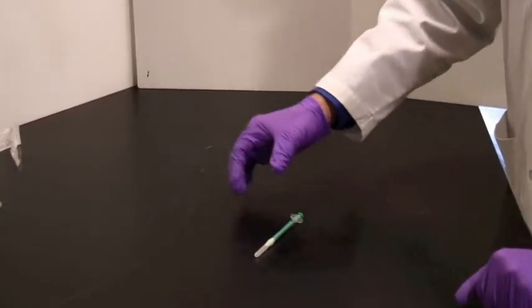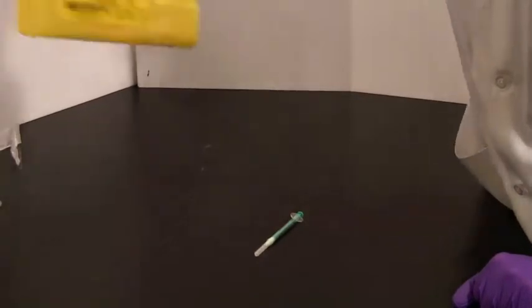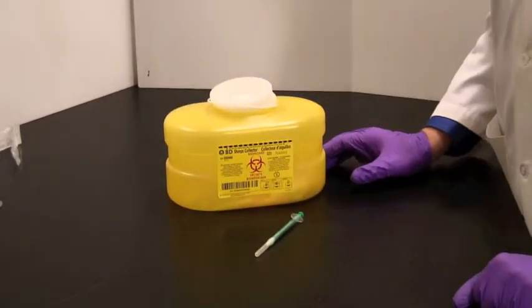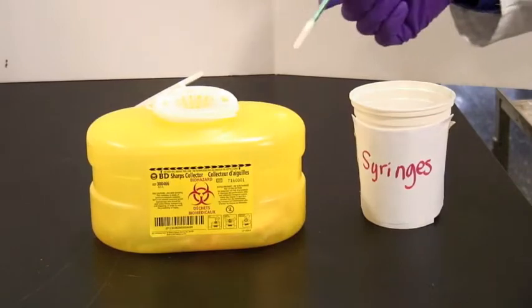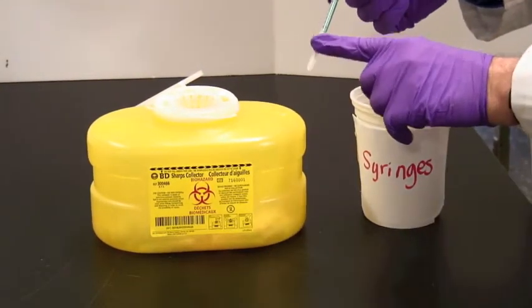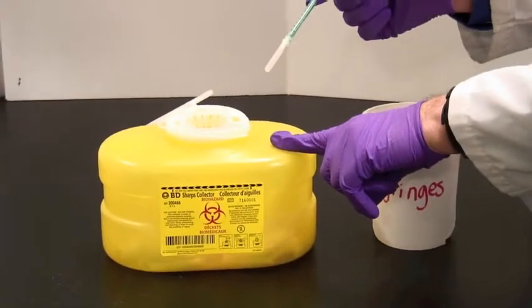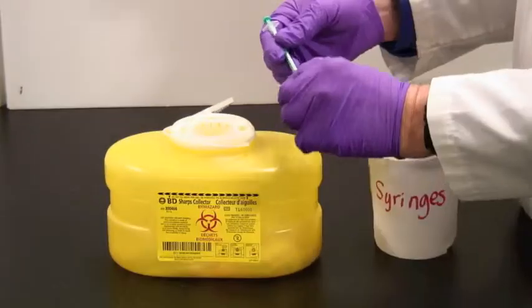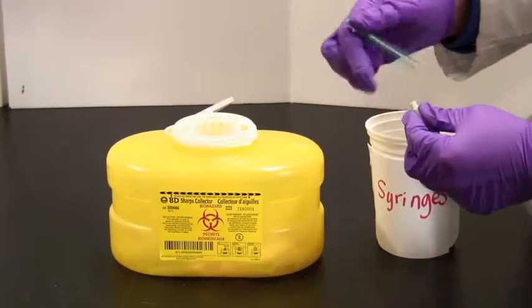Over at the TA station, you will find a bright yellow sharps disposal bucket. Once you have your syringe ready to dispose of, the needle itself goes into the sharps bin. That's this thing here. If, for some reason, the needle has come off, you can just pop it in like that.